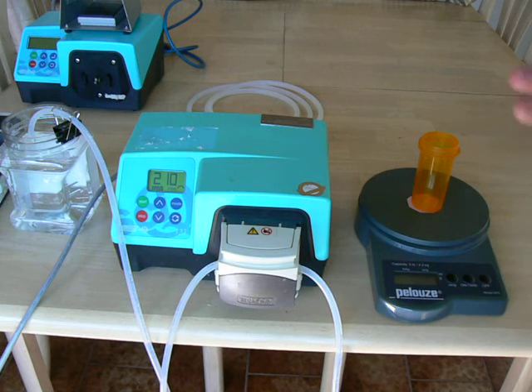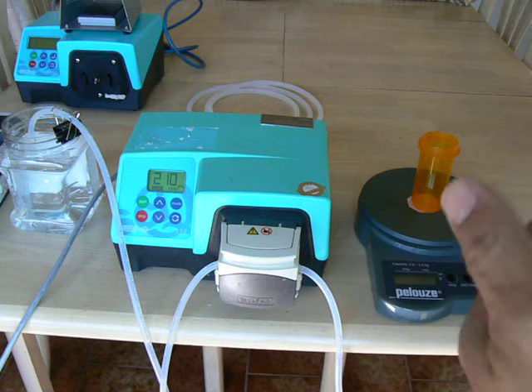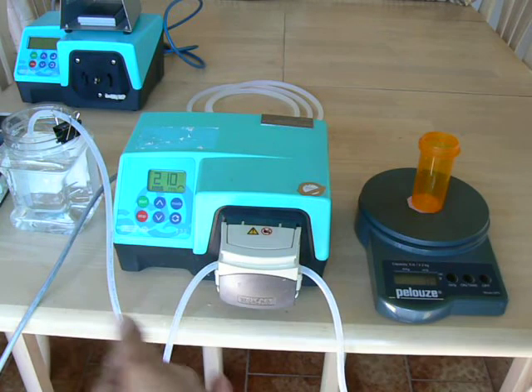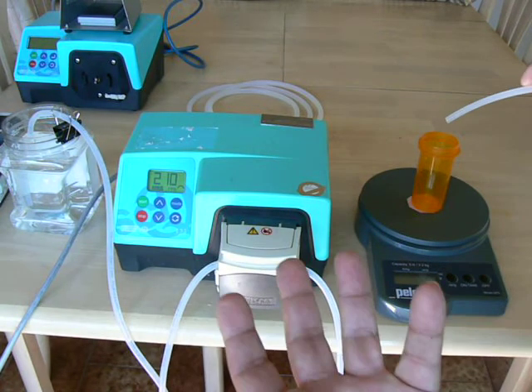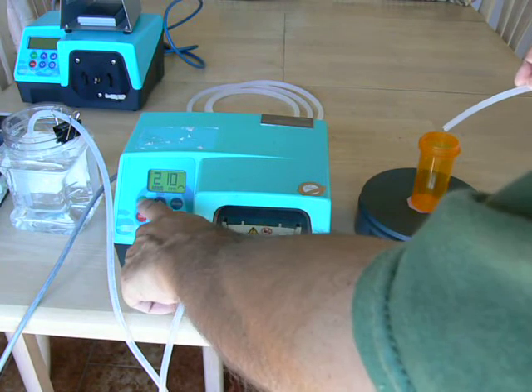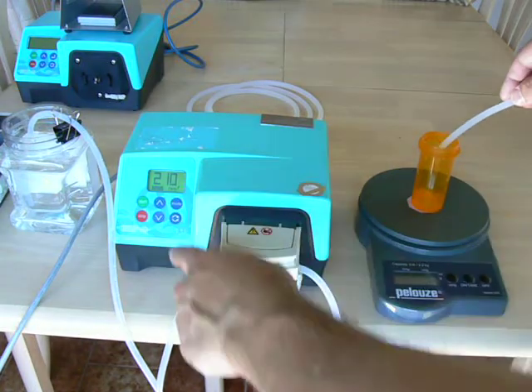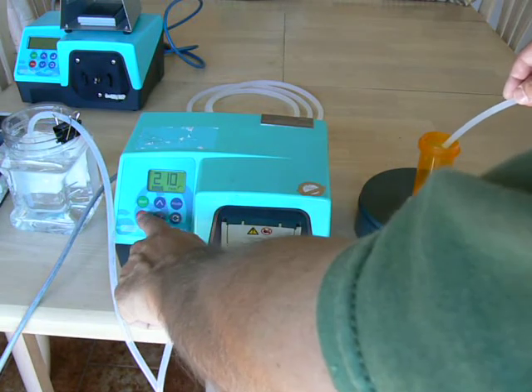You would need some way to measure your dispensed volume — either a graduated cylinder, a beaker, or a balance. We'll use this balance, set to grams, and try to get somewhere around 25 or 30 grams into our target vessel. When we do that, we hit start. When we get to our target, we hit stop twice in a row.